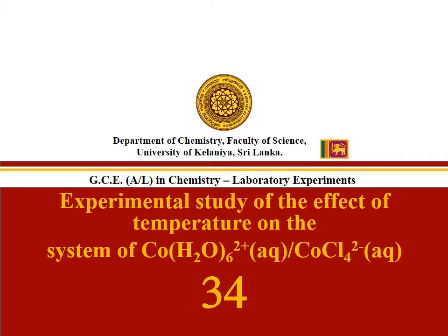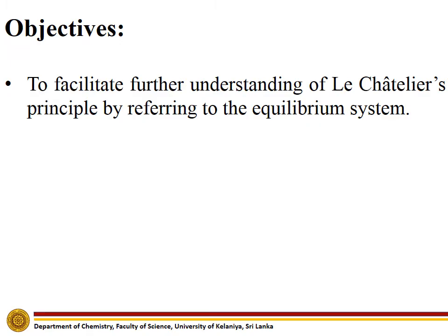Experiment number 34. Additional experiment. Experimental study of the effect of temperature on the system of hexa-aqua-cobalt-2+ and tetrachloro-cobaltate-2-. The main objective of this experiment is to facilitate further understanding of Le Chatelier's principle by referring to the equilibrium system.